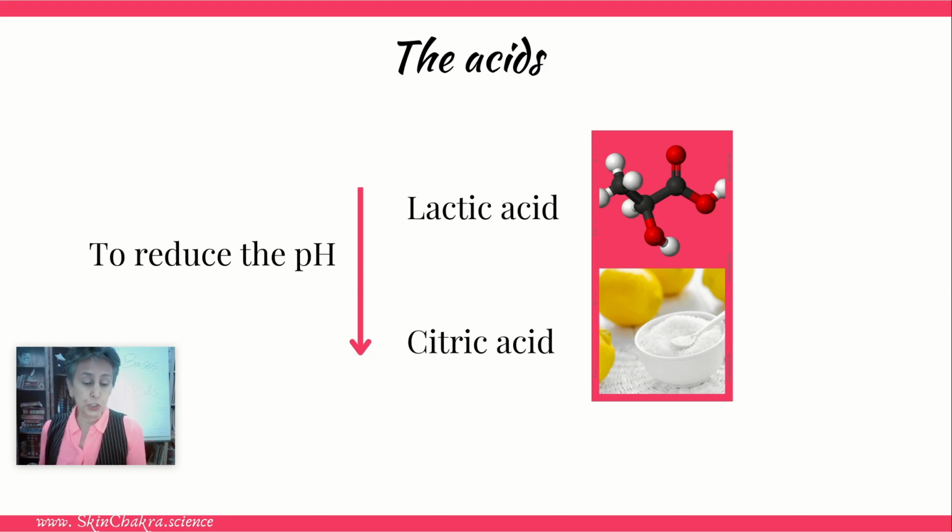To reduce the pH, we use acids. This is something that you know from high school, even if you are not a chemist. And the acids that we use in cosmetic formulations are lactic acid or citric acid. Please do not use vinegar to reduce the pH.